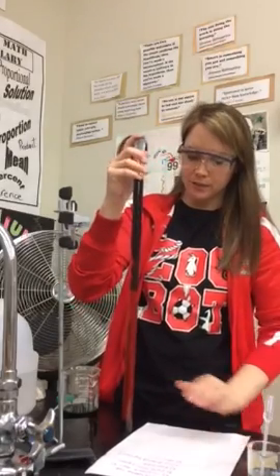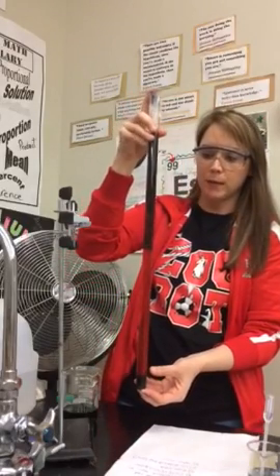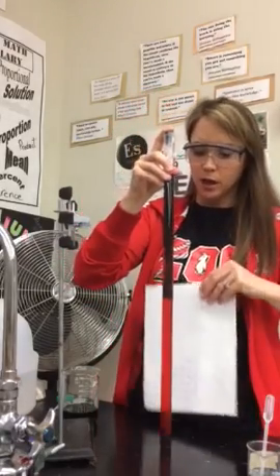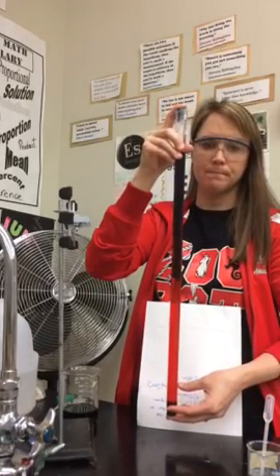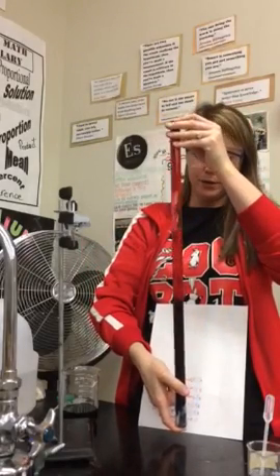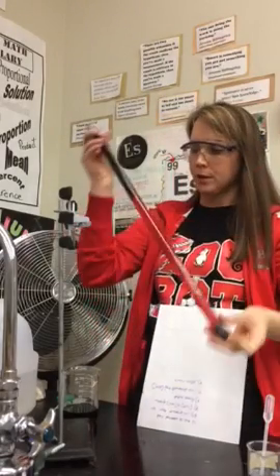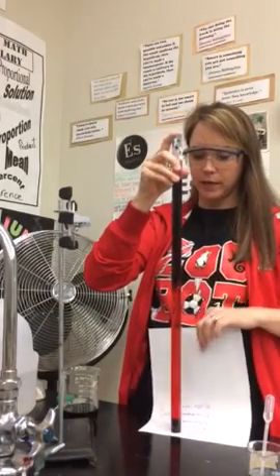And question 6, when I mix the two solutions and I invert the tube again, what color can you predict? Pause. So we're looking for the color that is present when the two solutions mix. And you want to look right in the middle here.